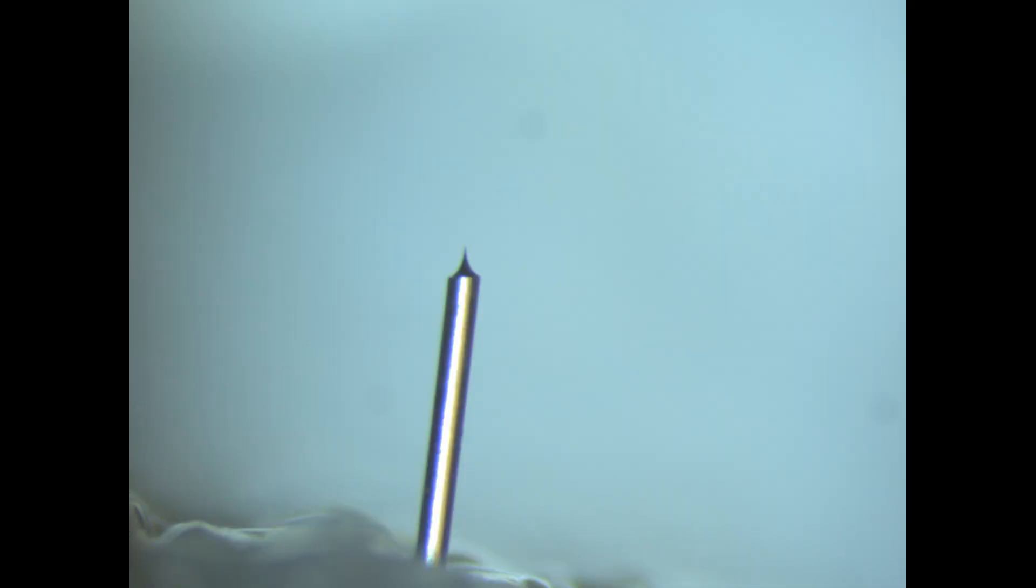This first tip is from the first macro video of an undisturbed tip. The second tip shows terrace-like etching caused by breaking the meniscus during the etching.